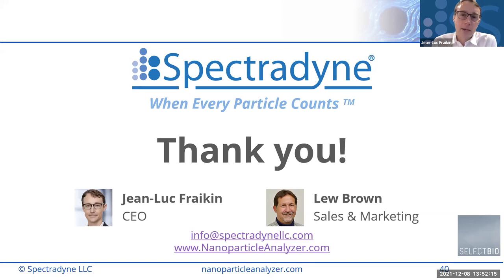Something as long as a carbon nanotube, we've tried those before, but you can imagine what a bunch of spaghetti at the nanoconstriction looks like. It doesn't work very well, so I don't recommend that application. In terms of limitations of the technology itself, I think you hit it on the head. It's very good at measuring the size and concentration of particles, but for the time being, we can't tell you what the particle was, but that will change, so stay tuned.